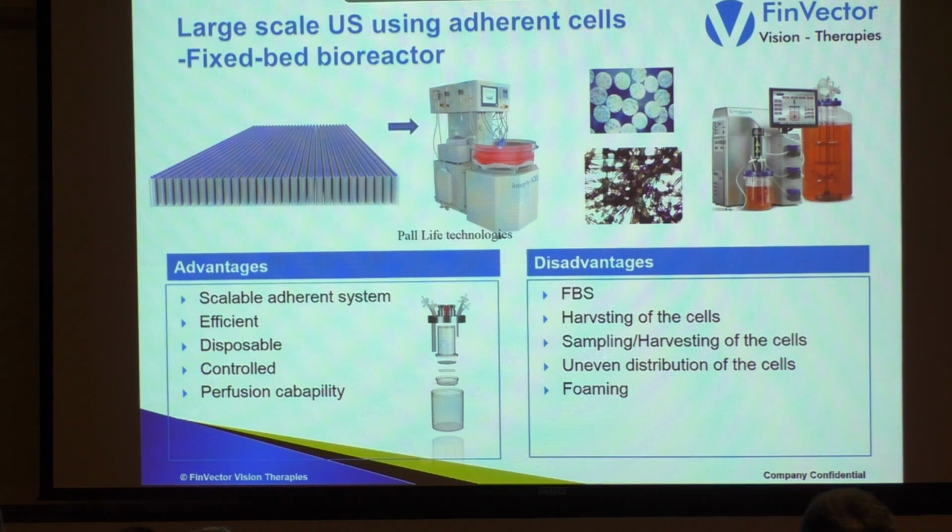My point here is the harvesting of the cells: from this kind of system you have problems getting cells out. You can easily put cells in, you can easily grow them, you can even easily get your virus out, but you don't easily get your cells out. So if your product is inside the cells, most probably you need to use some chemical lysis or autolysis just to release your virus to the media. But it's also a question, if you are using this large equipment, how you are producing your cells for that equipment. Do you need to first build up a huge flask-type approach to inoculate this system, or not?